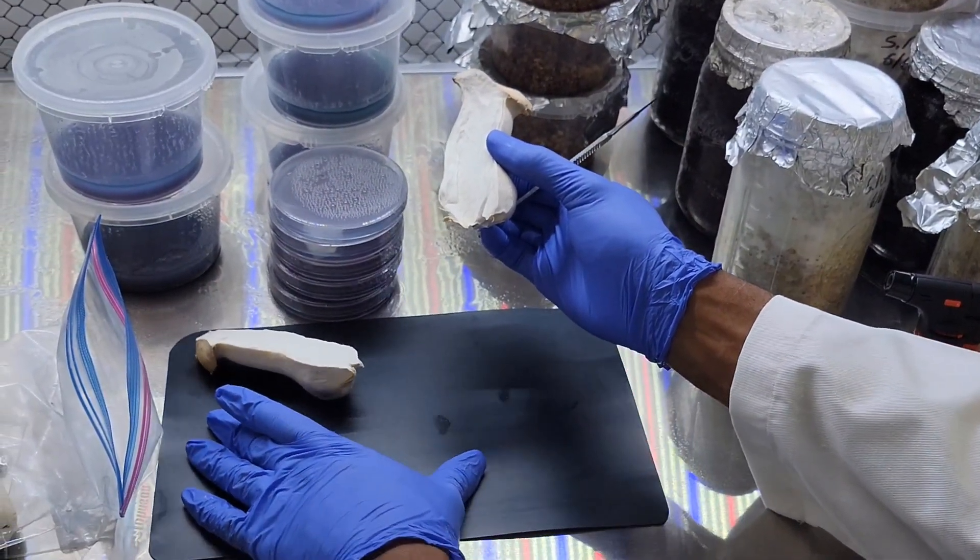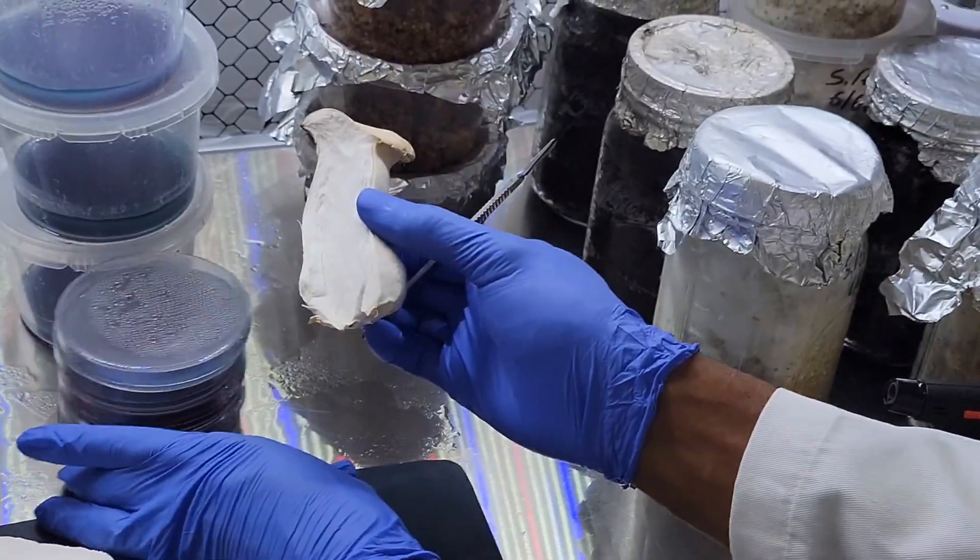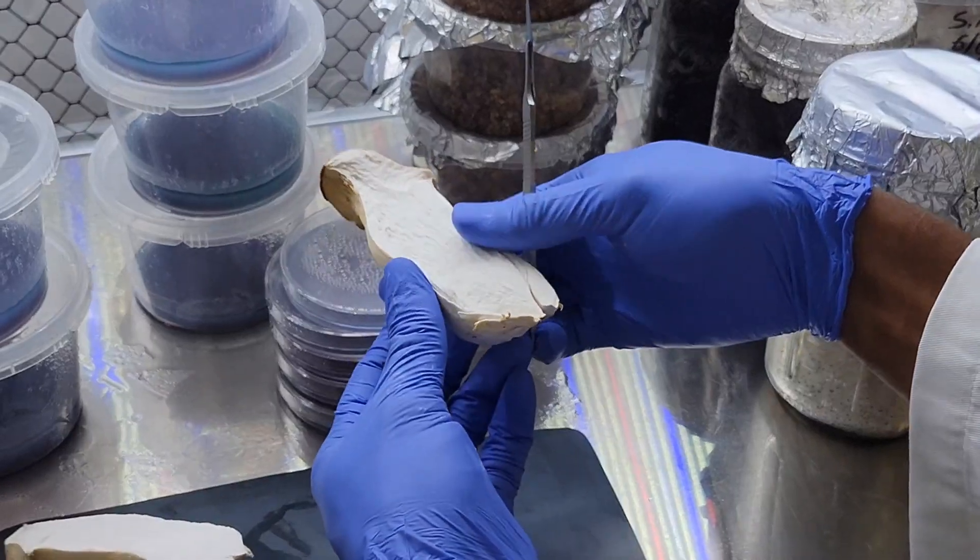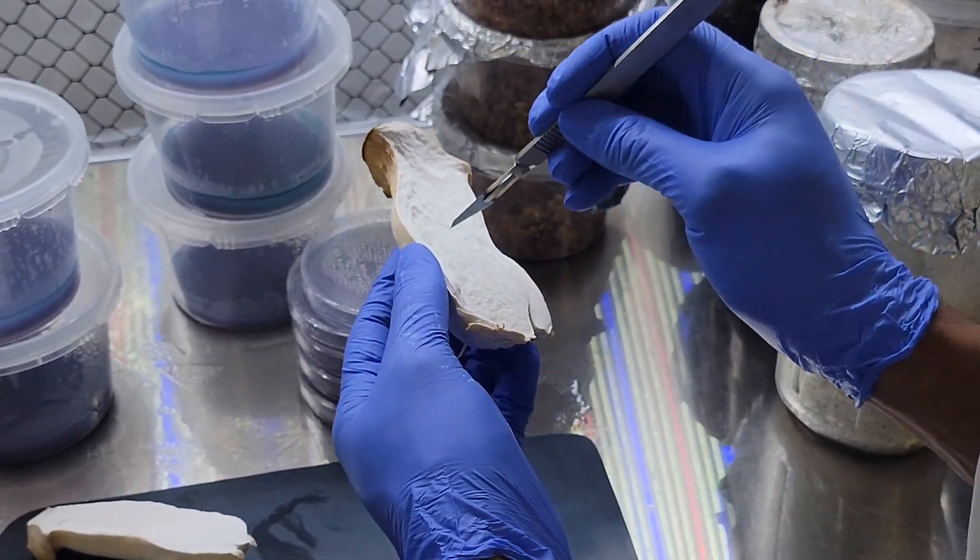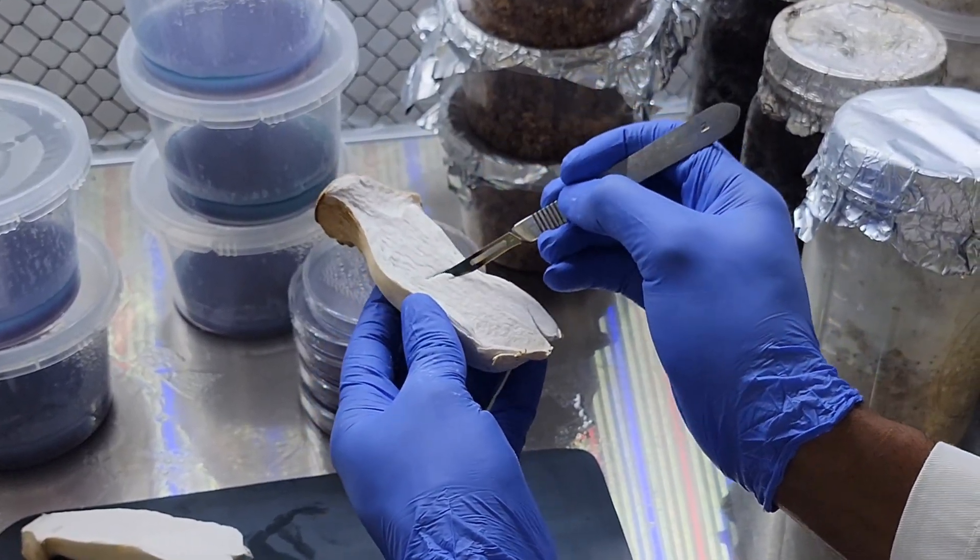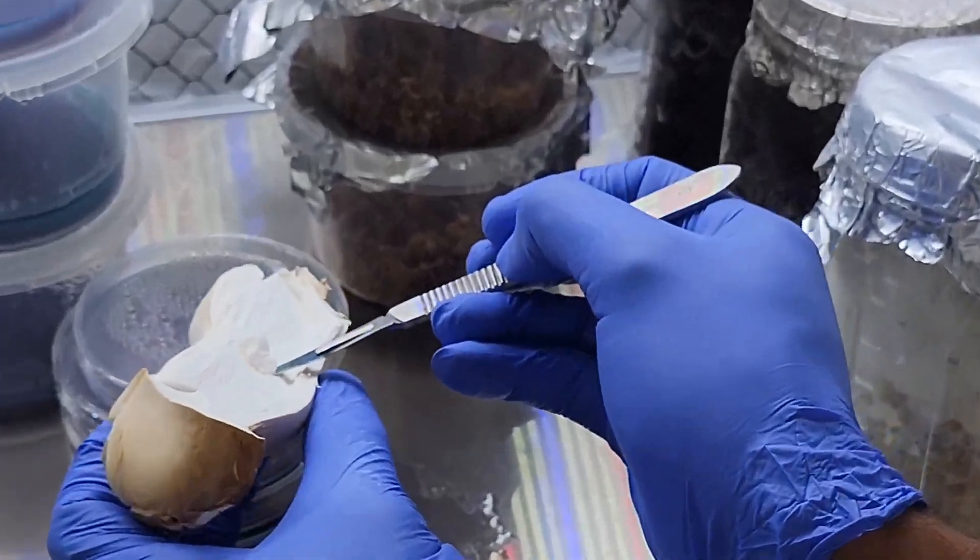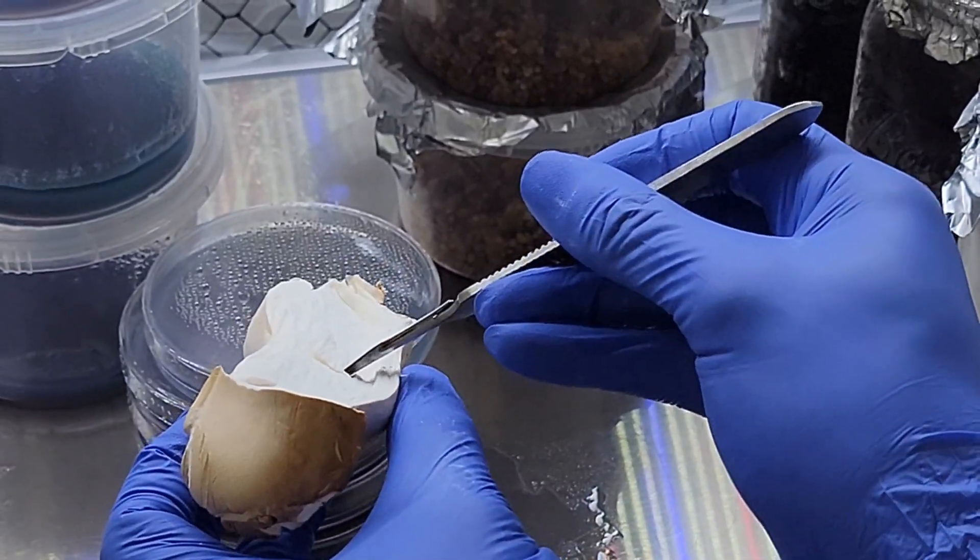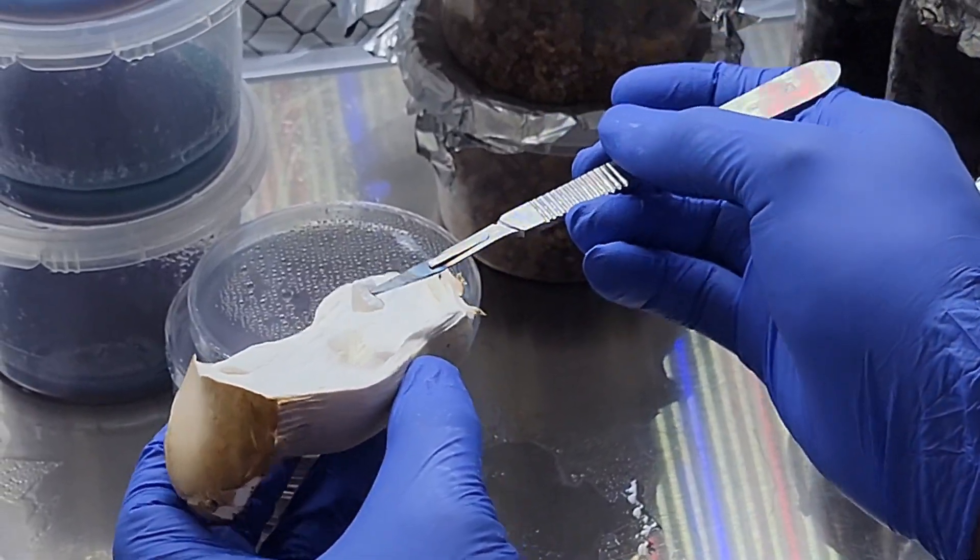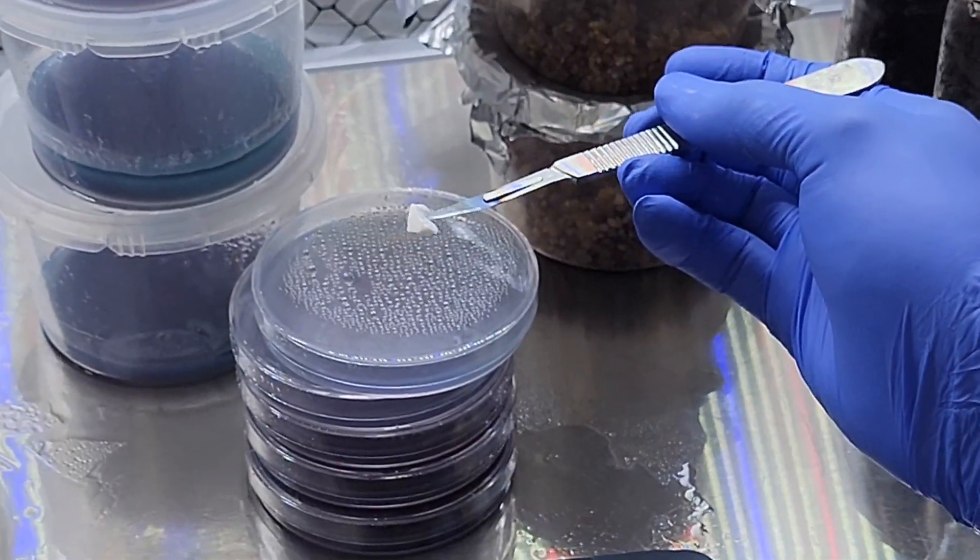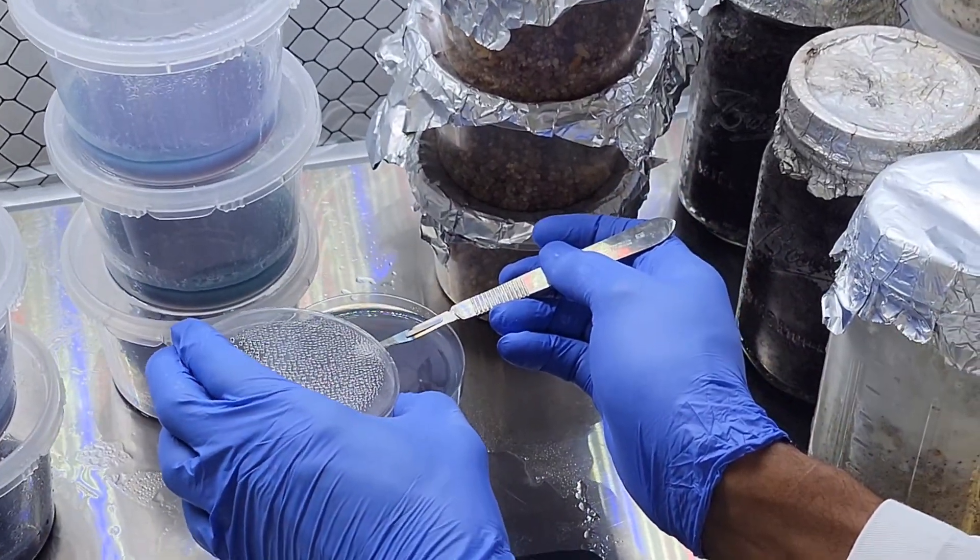So when you find a mushroom you want to bring it into sterile conditions, split it open, and then use a sterile scalpel or knife to cut a sample out from the middle. This is a lot easier with a mushroom like this because it's super meaty and there's a lot of mycelium on the inside to work with.